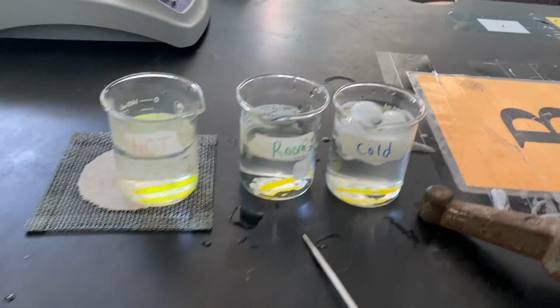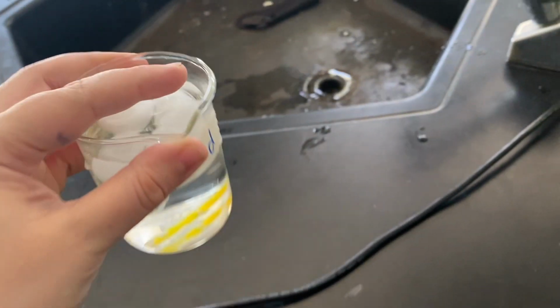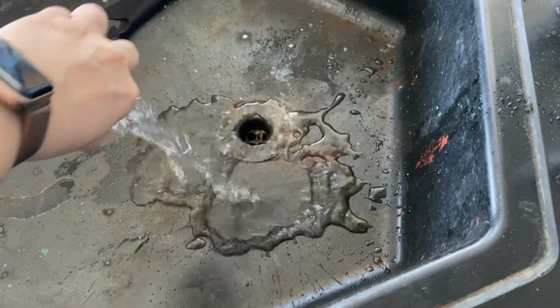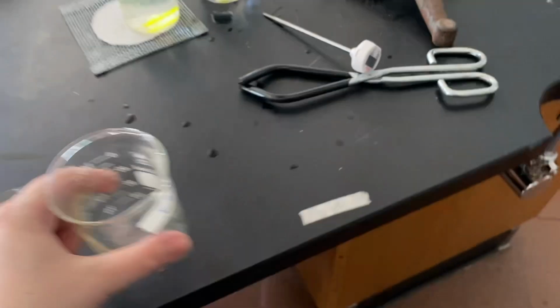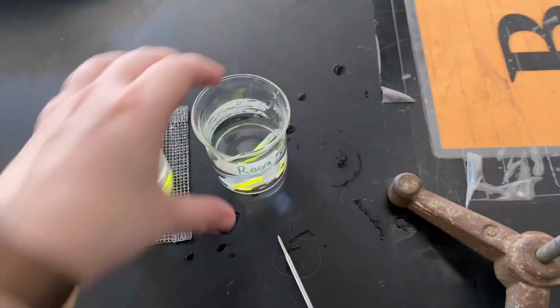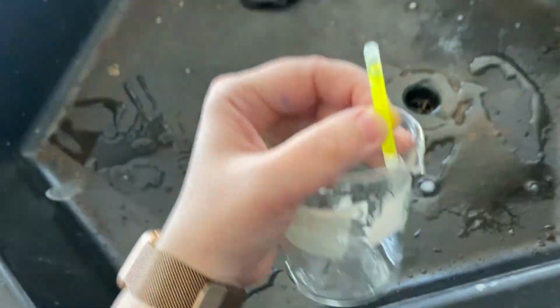So cleanup is super simple. What you're going to do is take each beaker and pour it in the sink. Now, if you want to keep your glow stick, you can keep it. If not, there will be a beaker on the teacher's desk to get rid of your glow stick. Again, room temperature one, you can just use your hand. Pour that out. Please don't let the glow stick go down the drain.